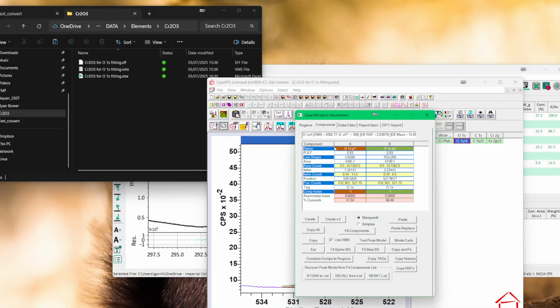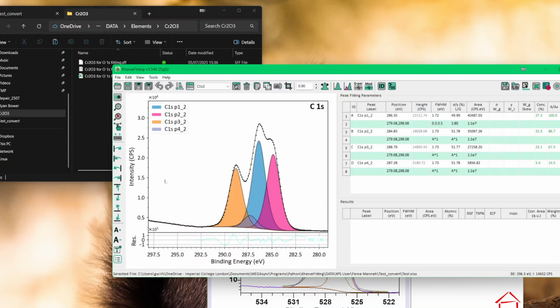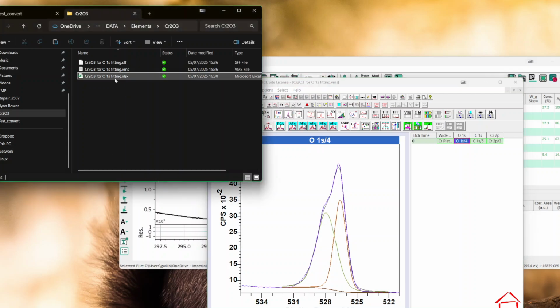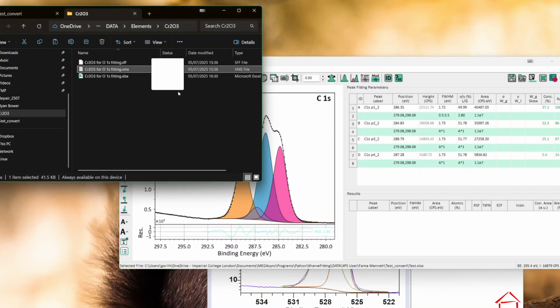And as long as those peaks are named differently, you can save it, for now, you can save it to KherveFitting. Later on, I think it won't matter what name you give, KherveFitting will just do it by itself. But for now, there is a bug if you don't change the name. So let's say now, this is this file, as I explained, and we have not something nicely fitted, but something like that. If I put it in KherveFitting, this is KherveFitting, and that's the VAMAS file.